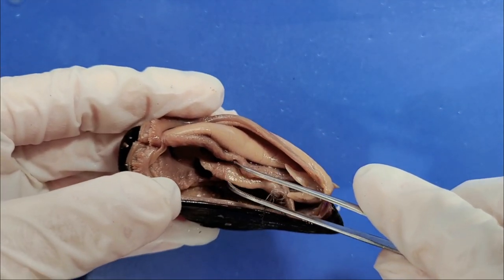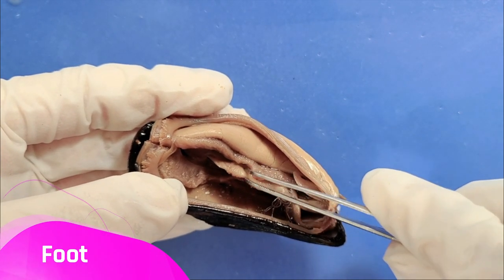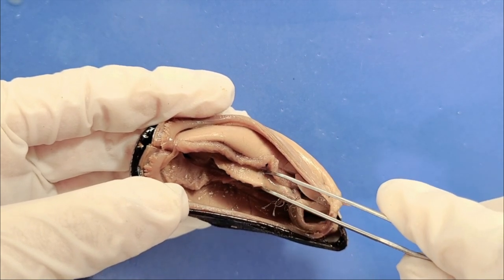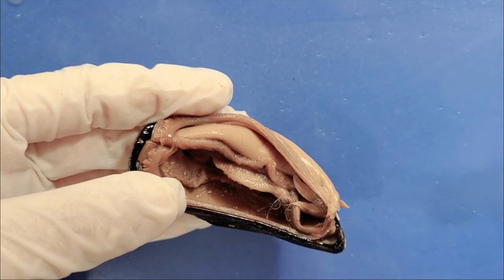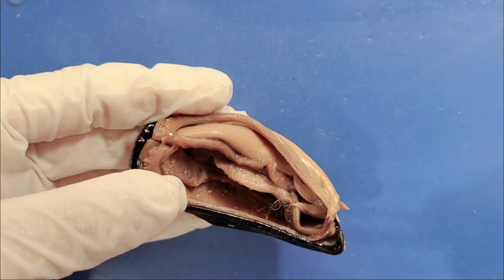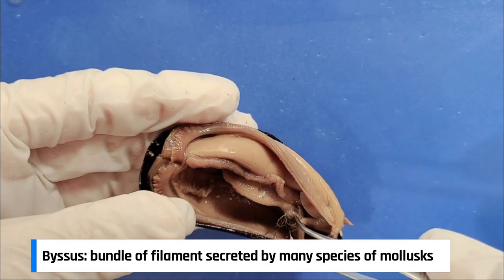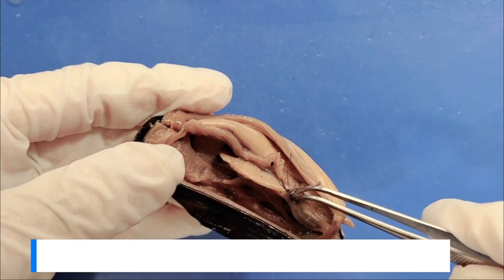Now in the middle of all of this, this fleshy structure here is the foot of the mussel. It's a muscular structure that allows the mussel to move around. It's usually bigger than this, but it contracts and shrinks when the mussel dies. While mussels do move a little, most are almost entirely sedentary and live attached to rocks and other hard surfaces. When a mussel wants to adhere itself to a surface, the foot emerges from the shell and secretes a thread of proteins which form a bundle of filaments called a byssus, which you can see right here. This byssus attaches the mussel securely to the surface.